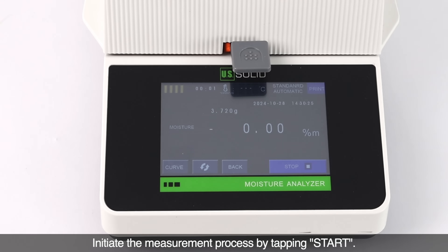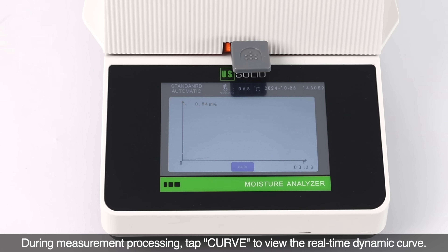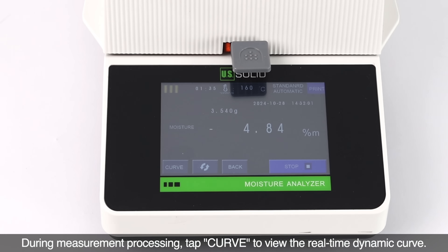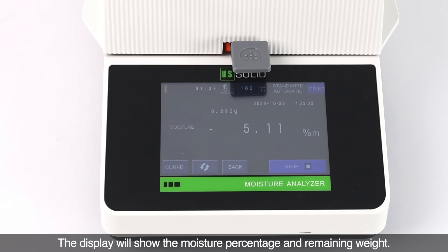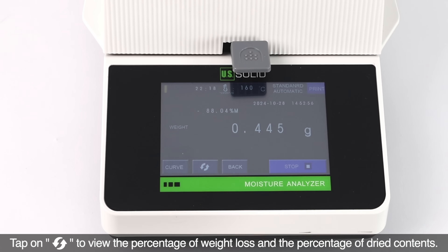Initiate the measurement process by tapping start. During measurement processing, tap curve to view the real-time dynamic curve. The display will show the moisture percentage and remaining weight. Tap on conversion to view the percentage of weight loss and the percentage of dried contents.